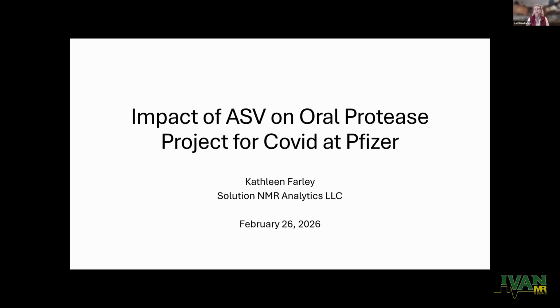Amin actually did a great job of introducing ASV, and that leaves me off the hook for talking about some of the details, because I'm really going to focus more on how you can use ASV to impact the chemistry project itself, not just your open access and your routine spectra.